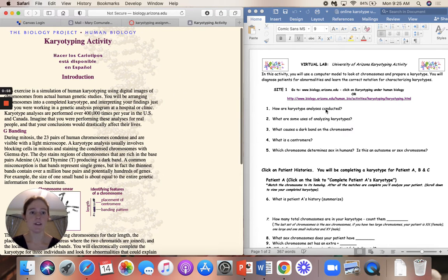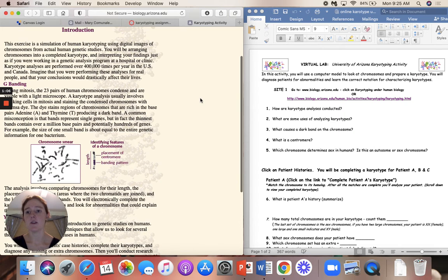And this is the website. If you click on this link here, this is what it's going to take you to. It says Karyotyping Activity, the Biology Project, Human Biology. It also has instructions in Spanish if you'd rather look at the Spanish version. So the first 5 questions you're going to be answering based upon the reading here. So let's see, it says, how are the karyotype analyses conducted? So you have to go through, we'll read through that.